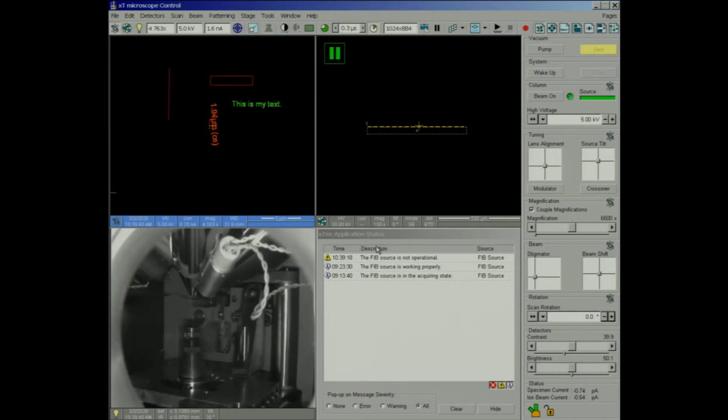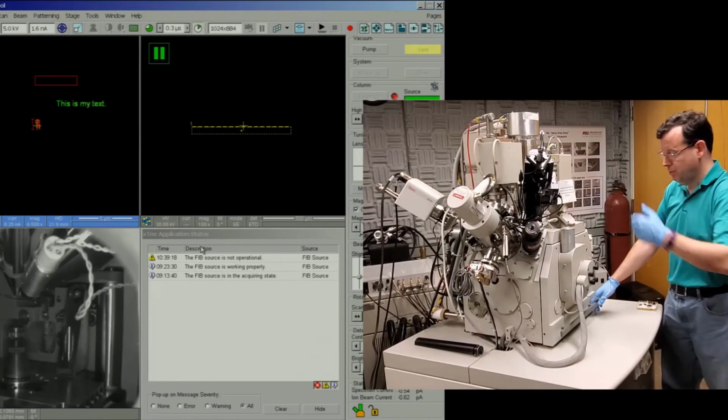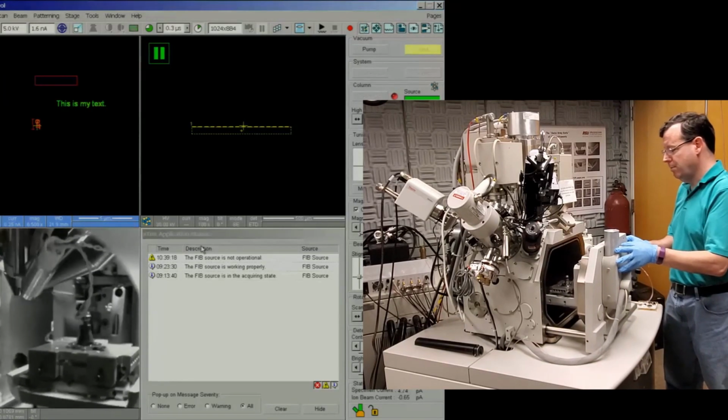If you had closed the gas cylinder, you're going to need to reopen it. Remember to close it when you're done. System is vented. See, the Omni probe is raised out. I can hear the gases escaping. Slide the door open, just like before.